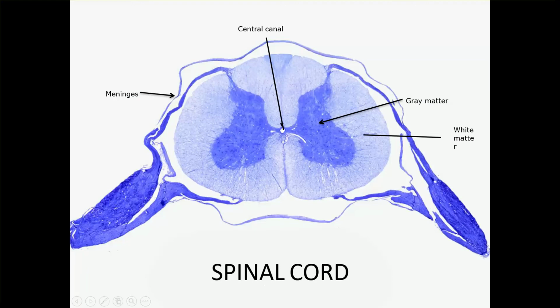Now the section of the spinal cord. So when we study the spinal cord, you need to identify which is the dorsal and which is the ventral aspect. Okay, so this is the dorsal aspect and this will be the ventral aspect on this side. You can see from outside the covering, this will be the meninges.